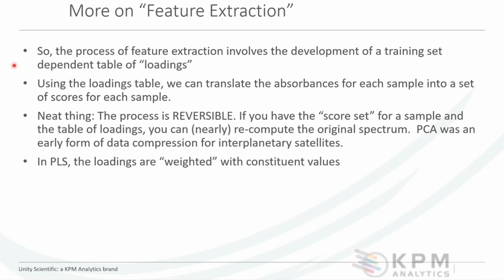Principal components are done on spectra only. In PLS, the loadings are weighted based on the constituent values. So with PLS, when we're calculating those loadings based on the calibration set, we are paying attention to the constituent values as well.